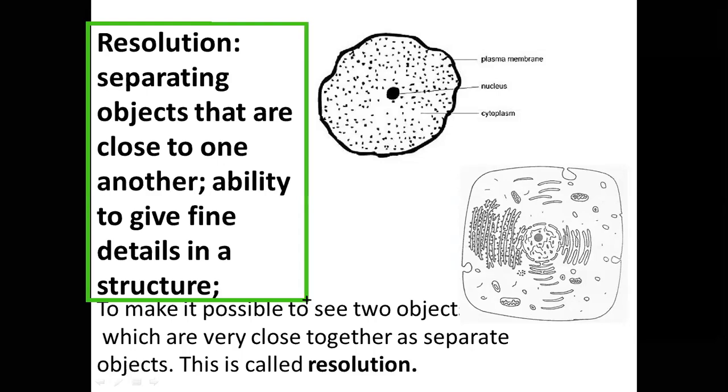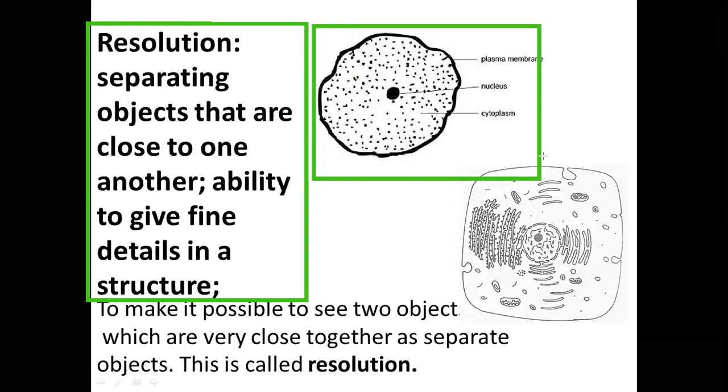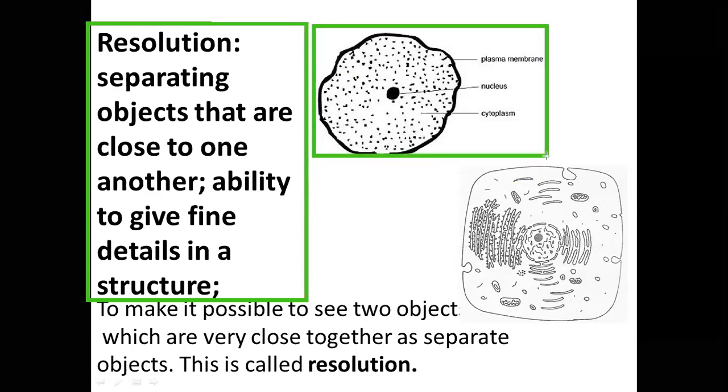Now, I want to illustrate that practically. Here we have an animal cell under a light microscope.